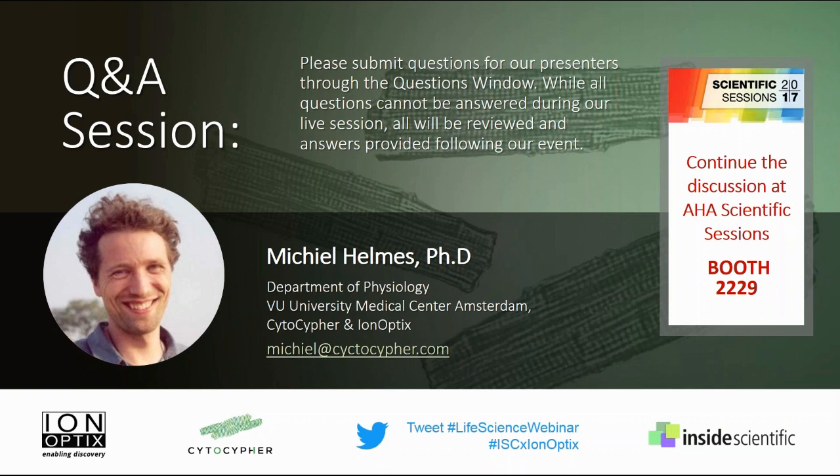I'm not sure if Joe has something to add to that. No, not really. There's always a lot of variability. At some point, somebody needs to do an overview of different isolation techniques and publish something that addresses how you would get the best myocytes, but it's hard to find that information. Every lab seems to have varying results. To add to that, even with our system, we find that the higher source of variation is still inter-experimental variability between different isolations. So it's an ongoing struggle to get it right.